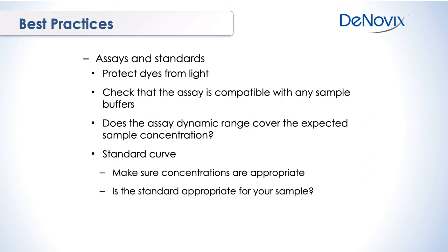They're kind of generic standards. So, for DNA there'd be something like calf thymus or something similar to that. If you have a very GC rich sample, using the standard that's supplied with an assay kit might not be appropriate, and you should make up your own standard, but that's something you need to test empirically.